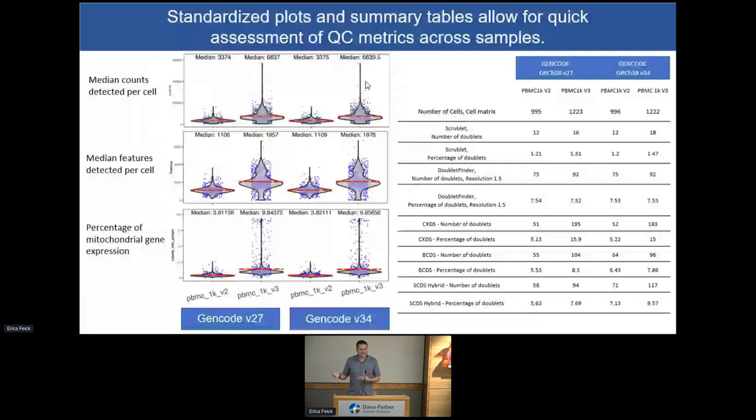All right, so now jumping into the downstream stuff, that's QC and upstream quality control. Now we want to do some analysis. So we have what we call an a la carte clustering workflow, which provides uniform access to tools from a bunch of different software packages and environments. The major steps in clustering are normalization, highly variable feature selection, scaling, dimensionality reduction, embedding, and clustering. We try to incorporate as many tools from Bioconductor as we can, from packages like scater, scran, and scuttle. We have the complete Seurat workflow, so you can actually run the Seurat workflow using a single cell experiment object without ever having to manually convert to a Seurat object. We do all that for you back and forth under the hood.